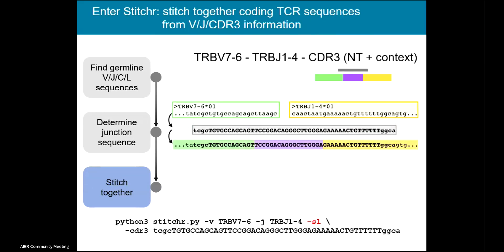If you have an application requiring perfect nucleotide-level matching, we have a function for that. It's achieved via the SL flag — the seamless option — where it's going to repeat that suffix-prefix matching but at the nucleotide level, trimming away nucleotides until it gets a match. The only caveat of this option is that you require some extra contextual bases on either side of the CDR3, just to make sure you can find a unique match between your section and the germline genes.